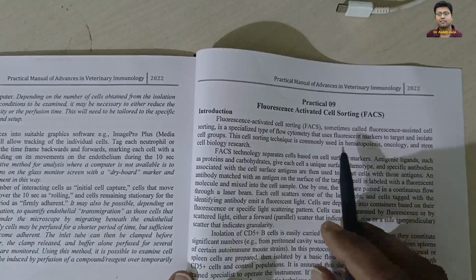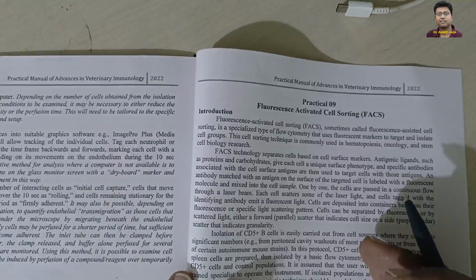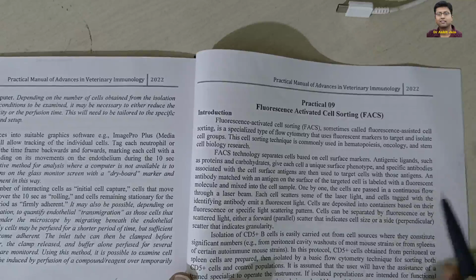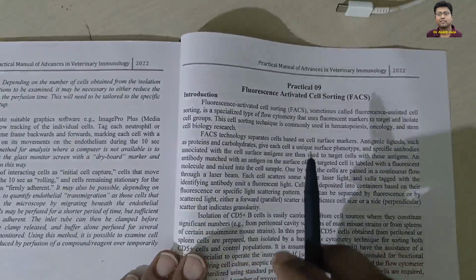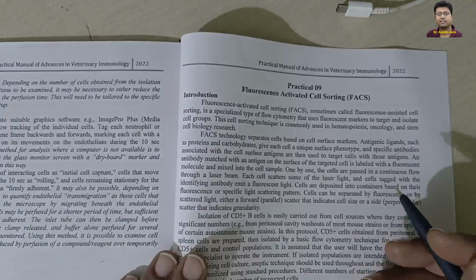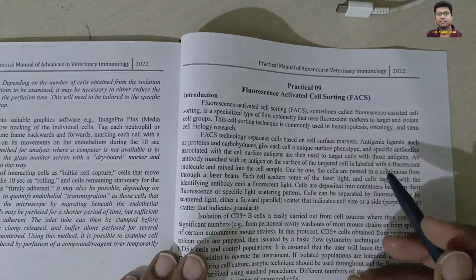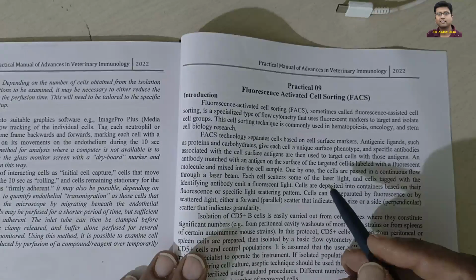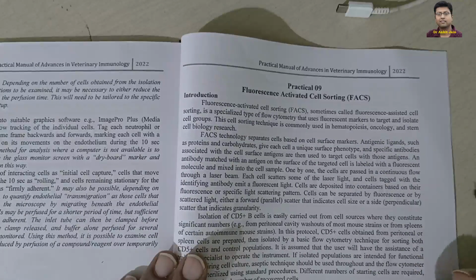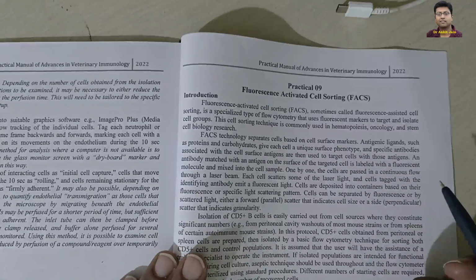So likewise here we are also performing the same thing. We are separating different cells according to their size and granularity. The basic principle of fluorescence activated cell sorting is that the cells have different markers, especially if we are talking about the B cell. It contains different types of antibodies. These antibodies attach with a specific antigen.